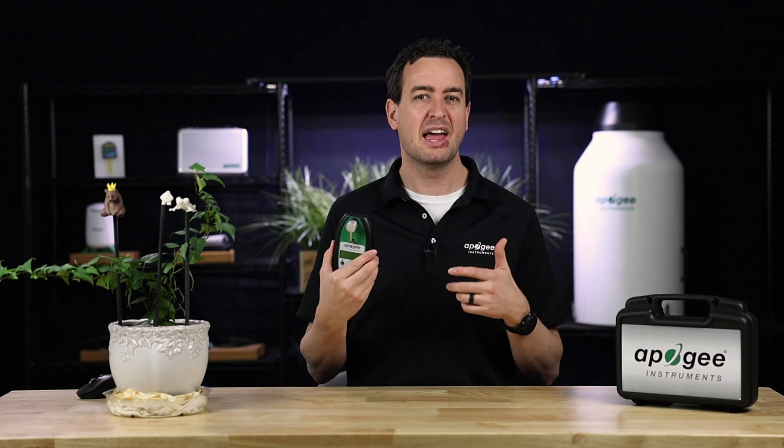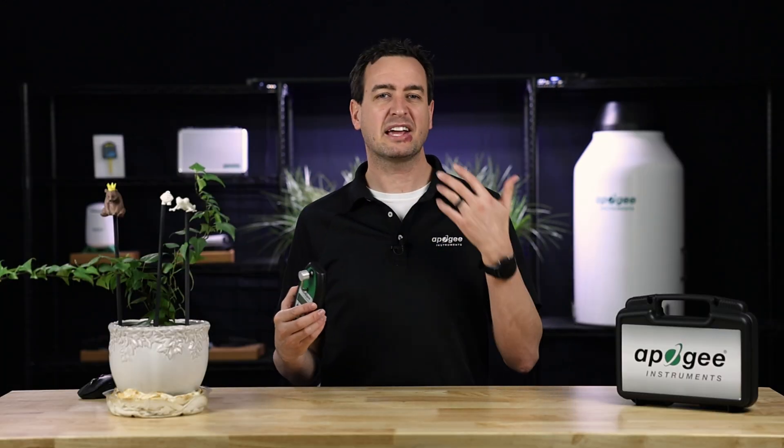If you want to learn more about the technical science behind how this meter works and how we were able to convert the greenness of a plant into quantifiable chlorophyll, watch the linked video — it goes into detail about creating the reference indexes used in this meter. Essentially, this meter measures the greenness of a plant and converts that number into a specific index equation, giving you a chlorophyll concentration amount.